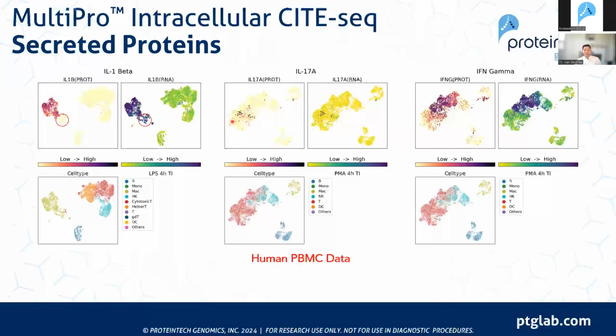And honestly, that is sort of expected because this is a highly inducible protein, and if a cell is not typically making any transcripts of IL-17A, then when it is induced, it tends to make the protein as well. And then, of course, I can't discuss any pro-inflammatory signatures without referencing interferon gamma, which is a key driver of Th1 responses. And here we can see that we can detect both the RNA and the protein at pretty high levels, very clean data as well.